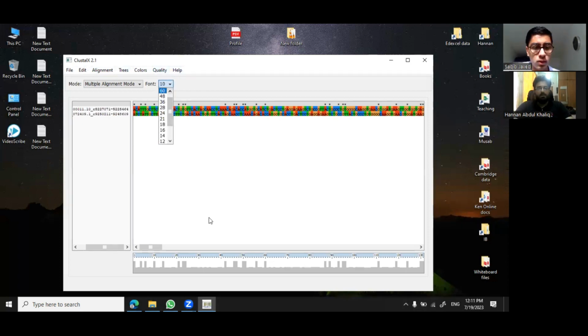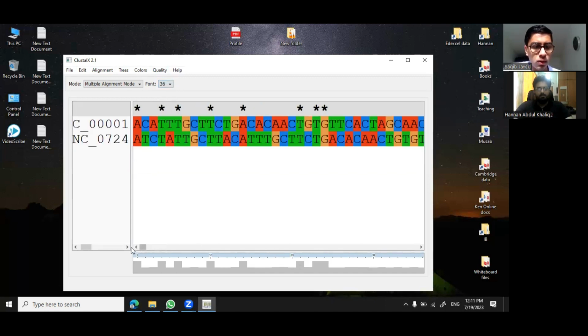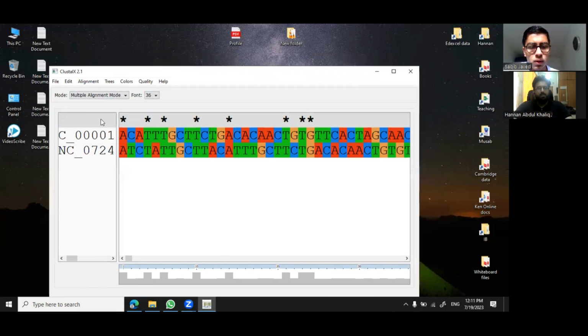I can increase the font. I have increased the font over here. Now above here, I have Homo sapiens HBB subunit, and down here I have Pan troglodytes HBB subunit genetic sequence. Now you can compare these.